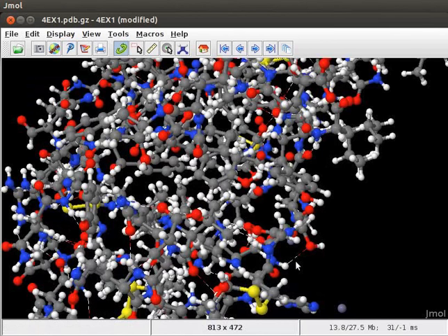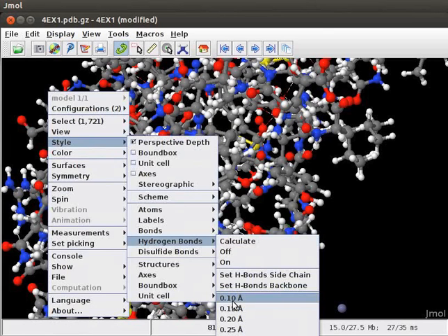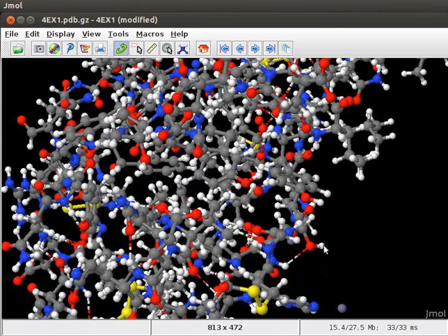The Hydrogen bonds are displayed as white and red long dashes. To change the thickness of Hydrogen bonds, click on 0.10 Angstroms option from the pop-up menu. Now on the panel, we can see thicker Hydrogen bonds.